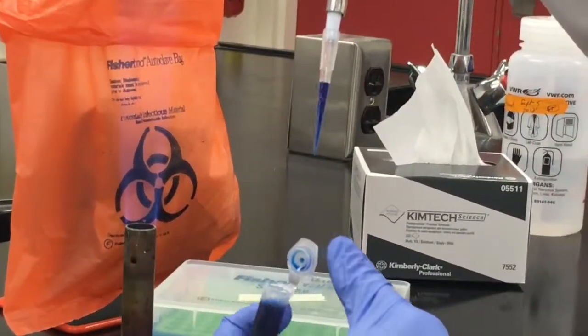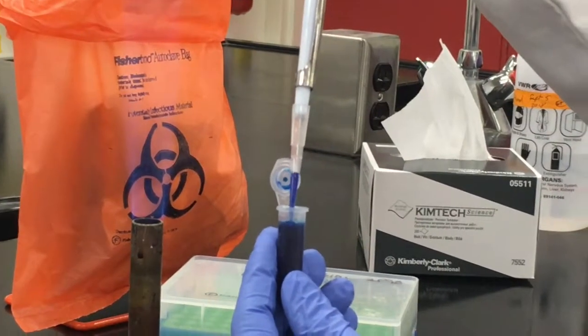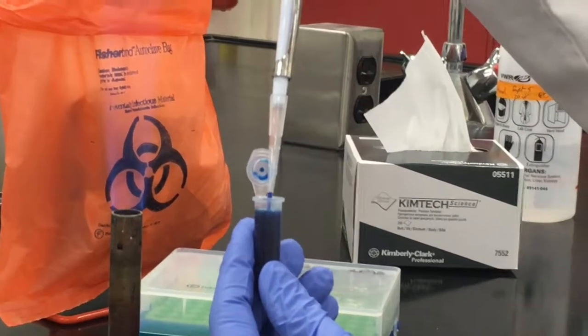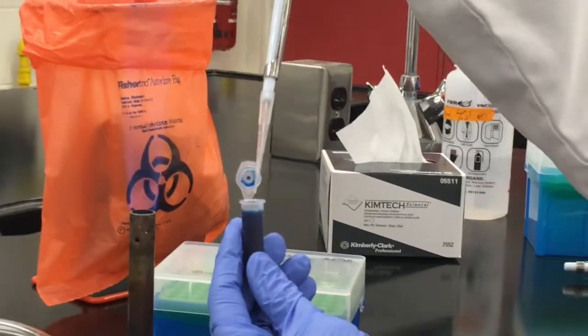When transferring numerous liquids into a single container always pipette the largest volume first. Smaller volumes can then be pipetted directly into the liquid already in the container for increased accuracy.